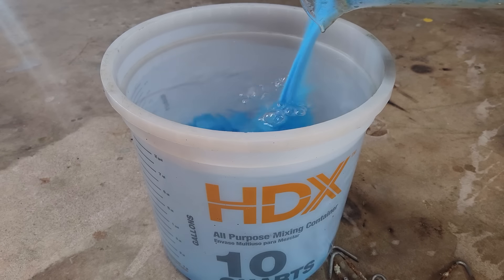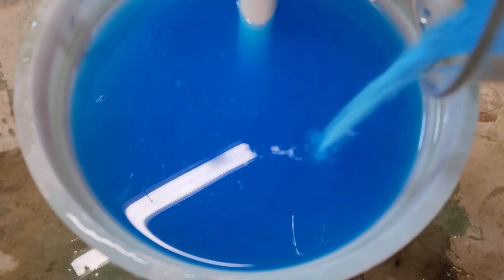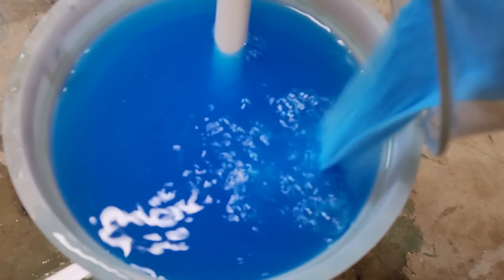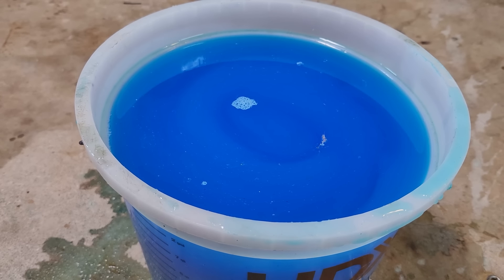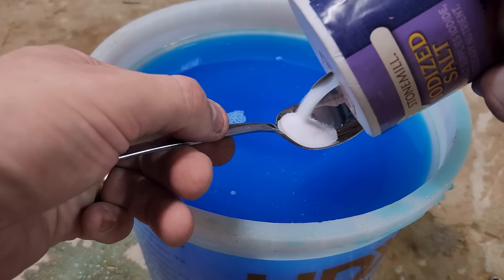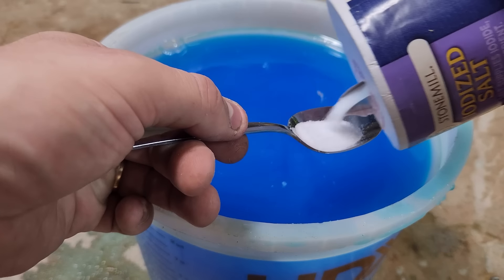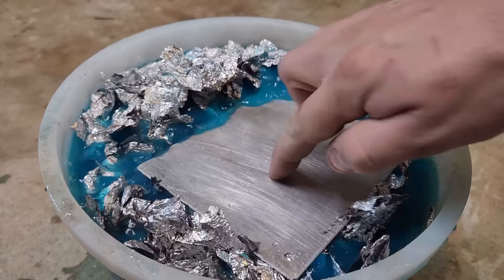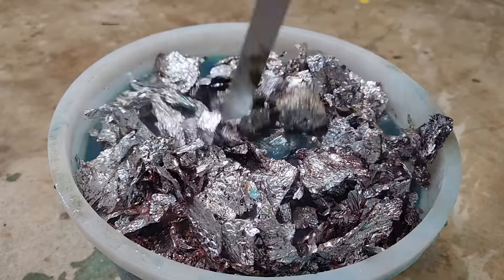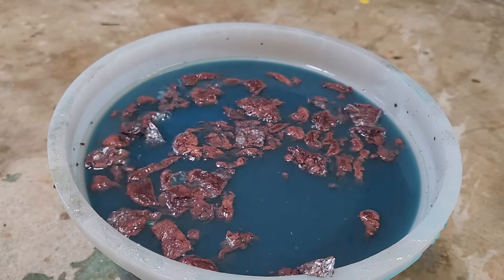100 grams isn't very much copper, so I decided to scale up my production. This time I filled a 2-gallon bucket and added 1800 grams of copper sulfate. This time I'll be dissolving scrap aluminum, because iron was taking way too long to dissolve. The catch is that aluminum exposed to the atmosphere rapidly forms an oxide layer that is difficult for the copper sulfate to get through, so I'm adding a few spoonfuls of table salt to get some chlorine ions in the mix that will act as a catalyst by stripping the aluminum oxide layer off.